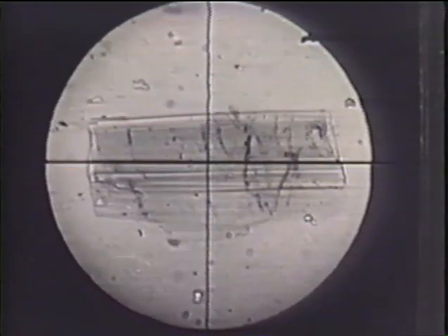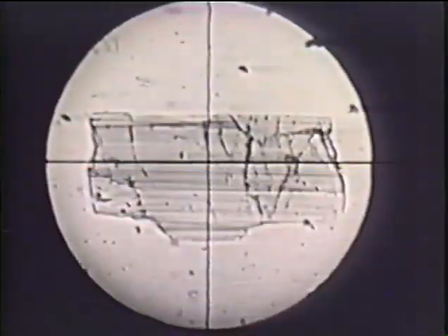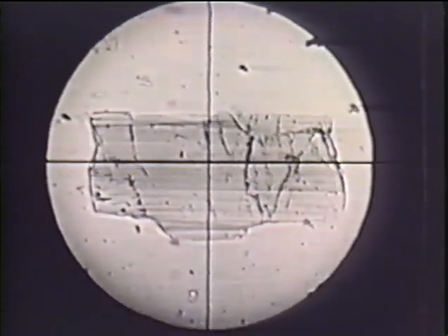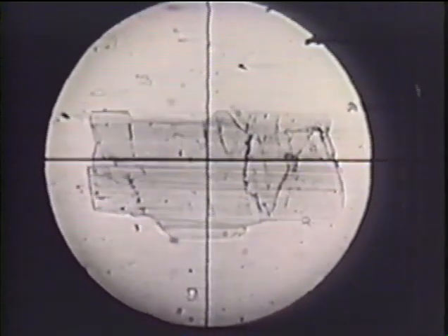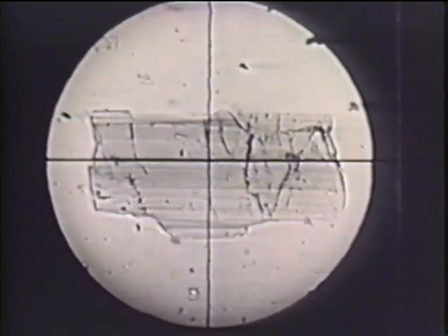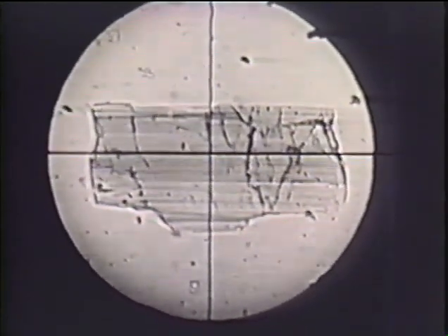Here is our grain of tourmaline. It's mounted in a cement of refractive index intermediate between the two indices of this mineral. We can see the pleochroism as before. Now we close the condenser iris. The relief becomes much stronger and Becky lines can be seen around the edges of the grains. When the prism edge is east-west the light is vibrating parallel with the prism axis of the crystal. The Becky line is now very distinct. It moves inward as the objective is lowered. The index of the crystal is therefore lower than that of the mounting medium.